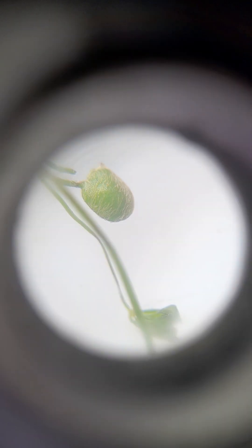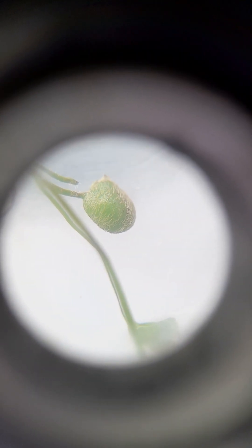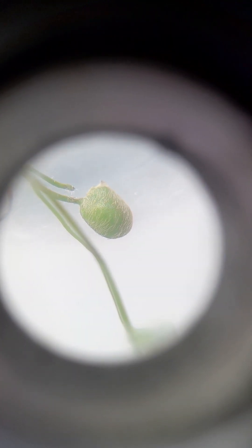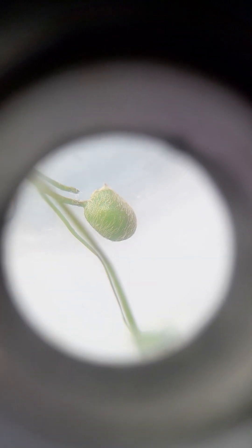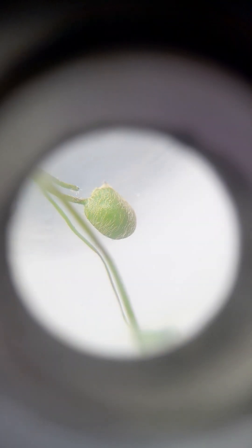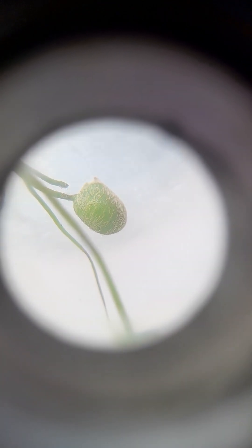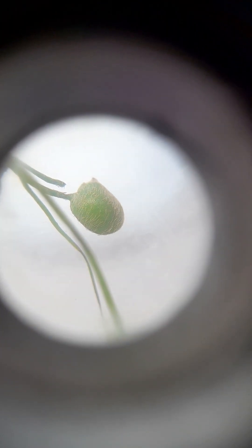They are bean-shaped structures. This is a very young stage. In the young stage, these sporocarp are generally very green and delicate, and you will see some hairy structures present there. But when it becomes mature, it will become brownish in color.